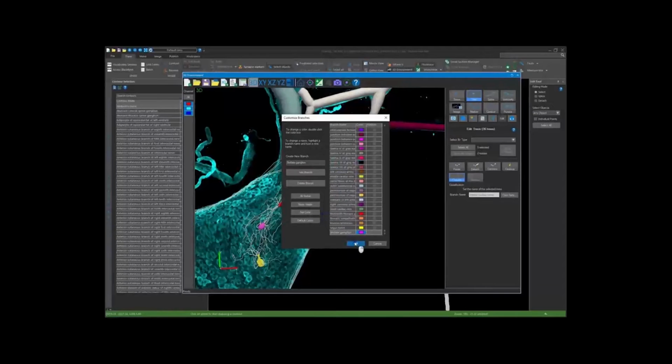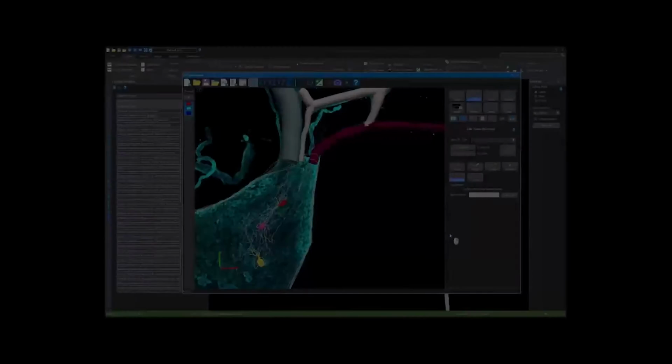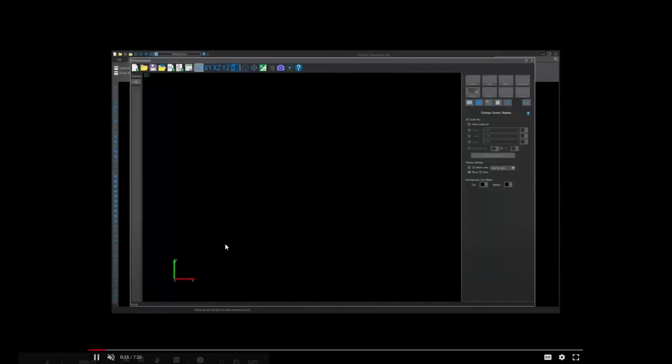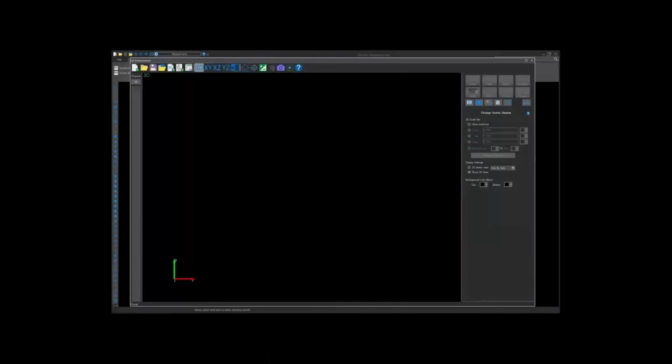And when you do that, that term will be added just to this list at the moment, and you can name that structure with that term. You will not receive a persistent unique identifier at that point because that term isn't yet in SciCrunch. But what Aidan is going to show you is how to update files even more after those terms have been added to the ontologies.